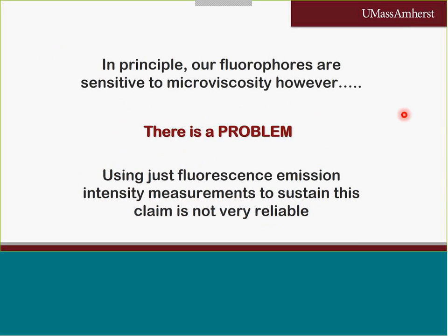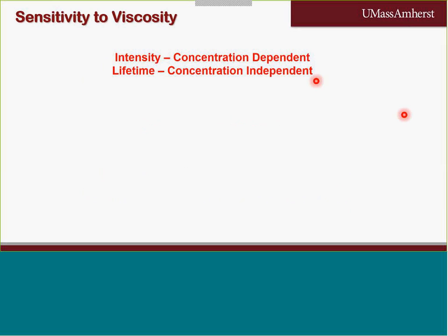However, there is a minor problem. Using just fluorescence emission intensity measurements to sustain this claim is not very reliable because the fluorescence intensity is concentration dependent. We have to have another kind of measurement that allows us to figure out if the concentration was not what was determining that increase in fluorescence intensity.